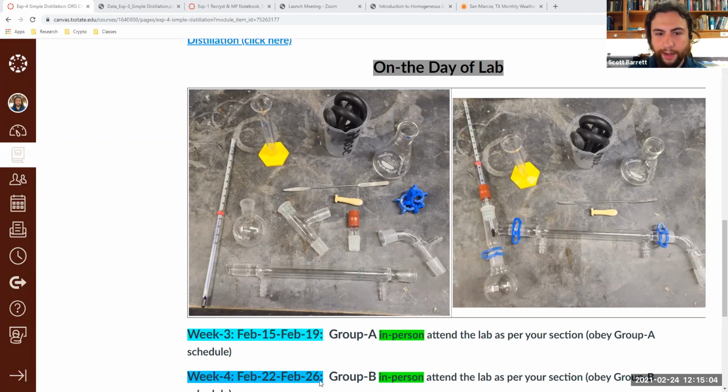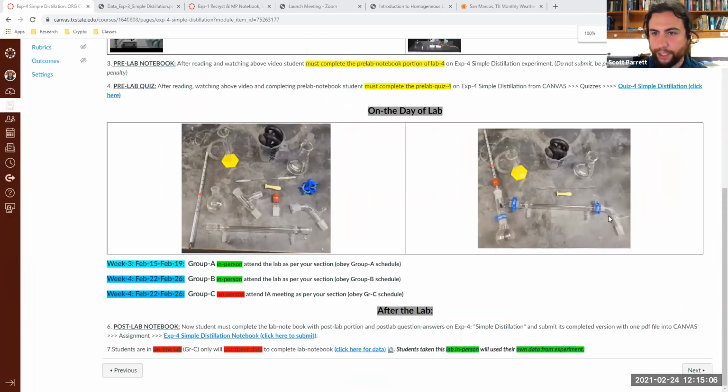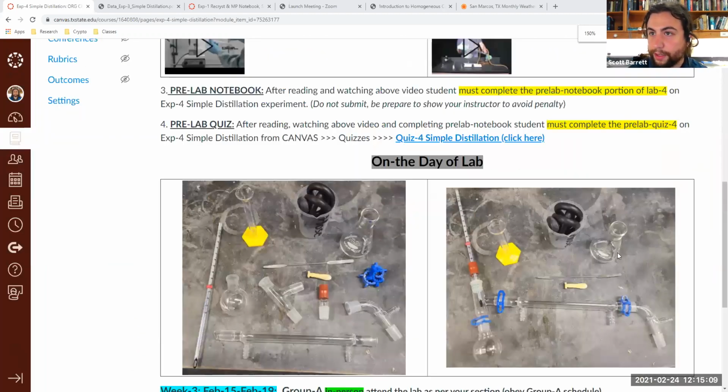And this would allow us to cool down our distillate in this condenser here. And actually, I like the picture here better because it shows the actual, let me move this over one second. Yeah, so this is the full setup.